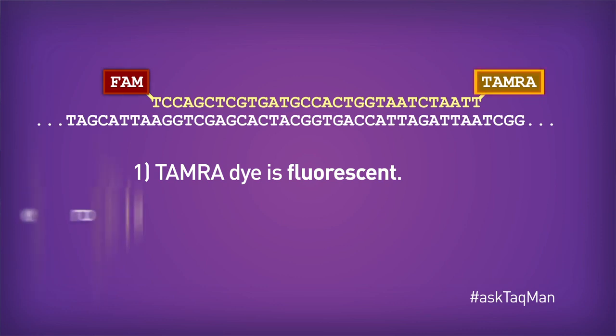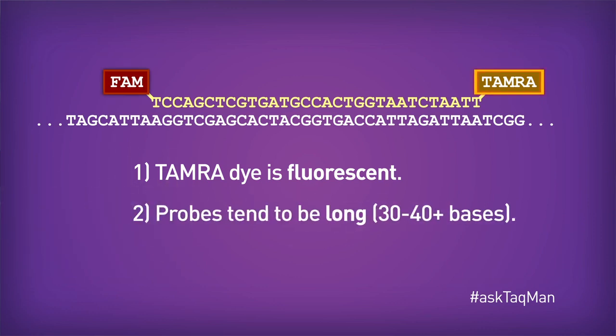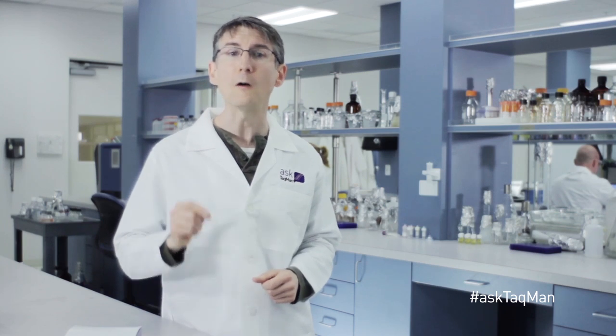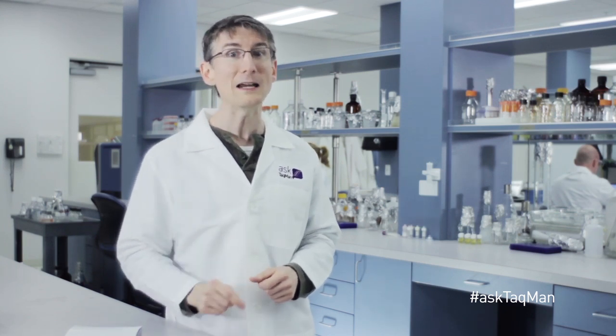The bigger concern? TAMRA dye quencher probes tend to be on the long side, and that's because probes need to have melting temperatures that are around 70 degrees Celsius. And in order to get there, the probe will often have to be 35 or 40 bases or even longer. And as we'll see in a moment, longer probes are often less specific. Yes, you heard me, less specific than shorter probes. I'll explain that one in a moment.